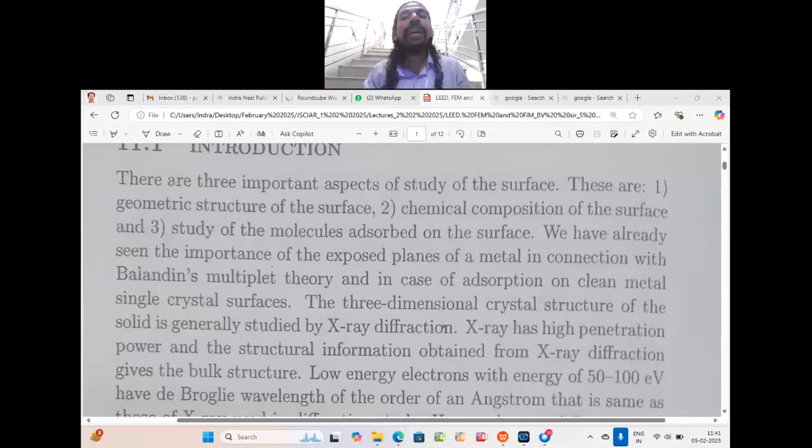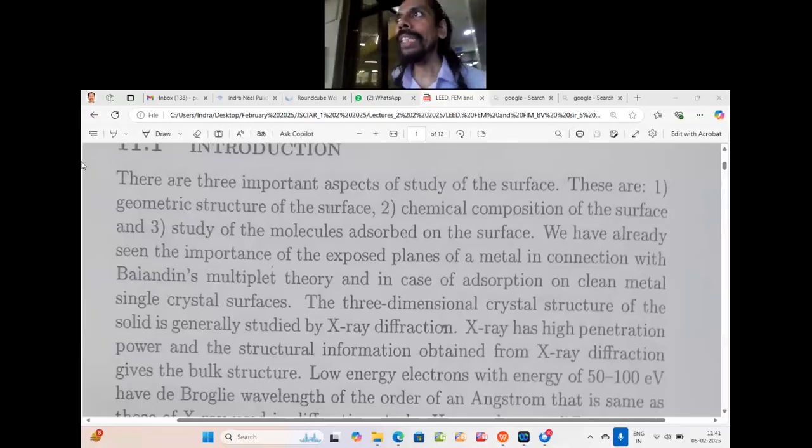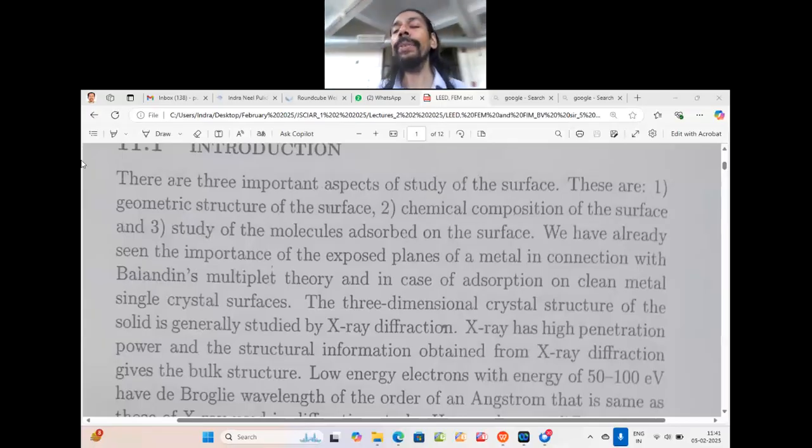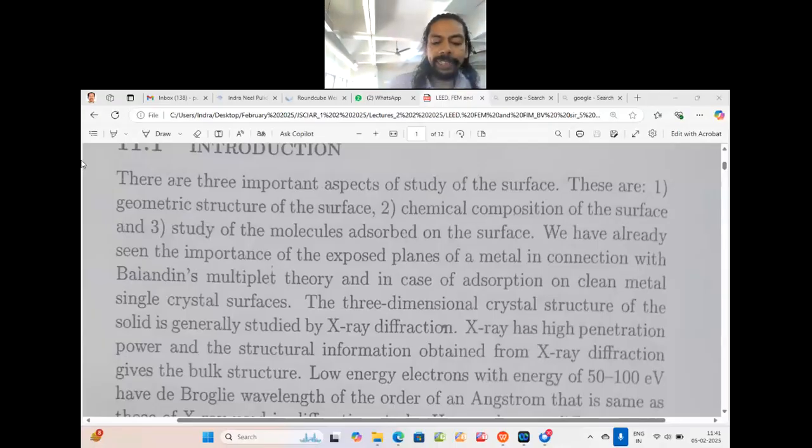So a particle is comprised of various crystallites, and each of the crystallites is separated by the grain boundary. From the grain boundary, we can always find the crystallite size using the Debye-Scherrer equation. Using the Debye-Scherrer equation, we can get the crystallite size. Likewise, XRD is a very potential technique for the calculation of crystallite size.